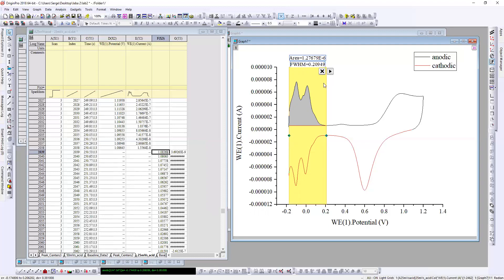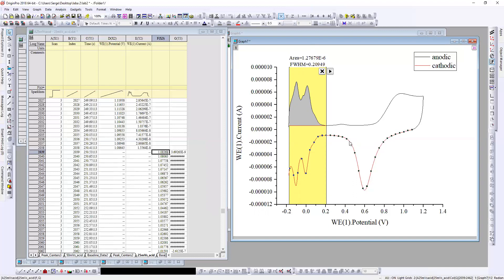Much better. Okay, now I have this value, it's good. And for anodic I do the same procedure. I choose this line.